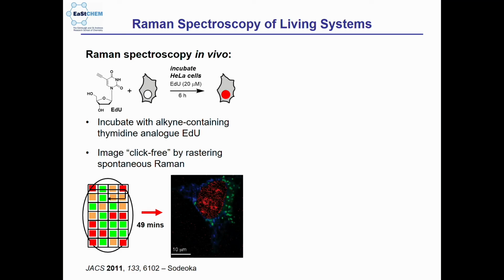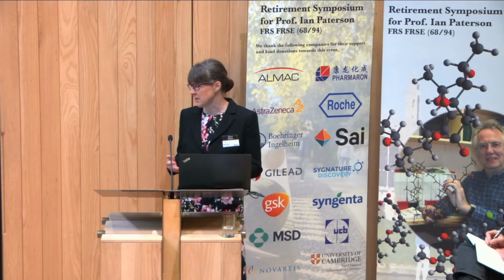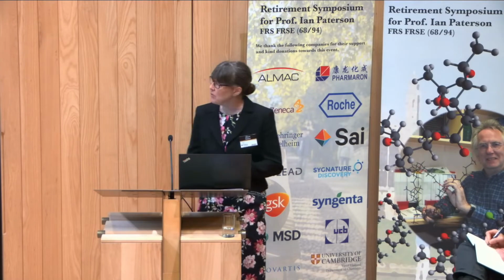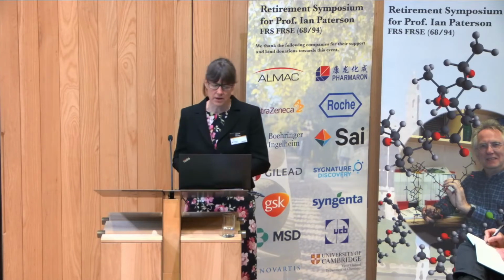So I'm going to tell you a short story which comes from the last 10 years of research in my group. I'm going to tell you a little bit about Raman Spectroscopy. I'm going to tell you about Raman Spectroscopy in vivo and why I think this is important and relevant to MedChem.